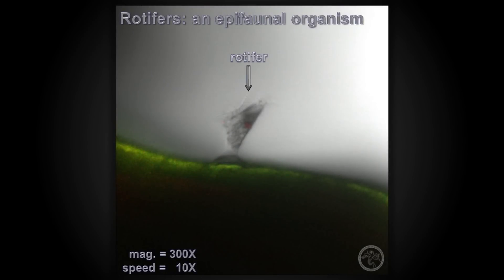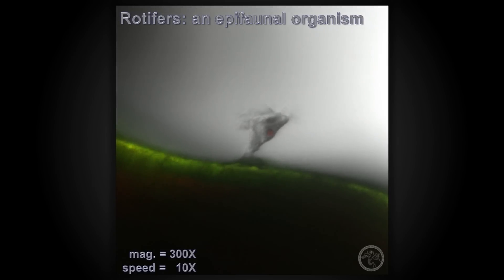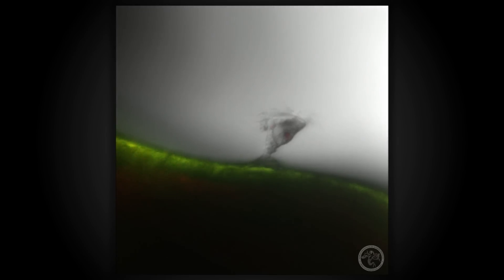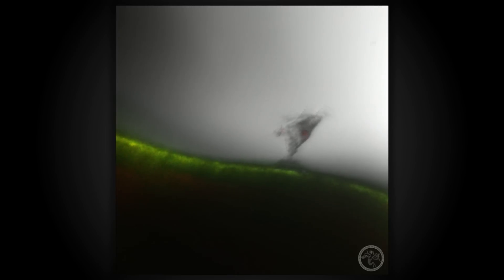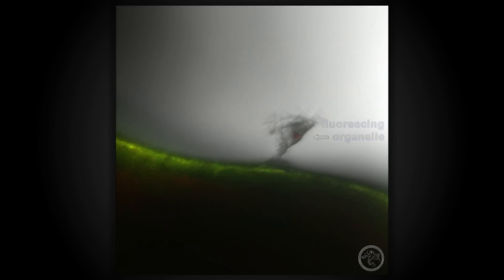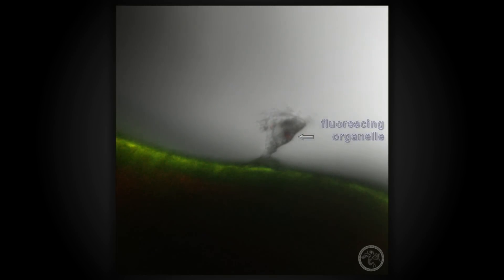Another important aspect of studying the coral symbiome is to identify its associated epifauna. This species of rotifer is one we often find when looking at lace coral. This one has a red fluorescing organelle, possibly from ingesting chlorophyll-containing phytoplankton.